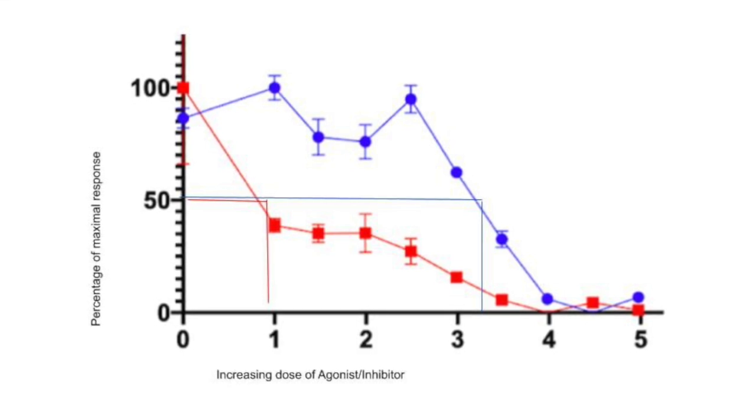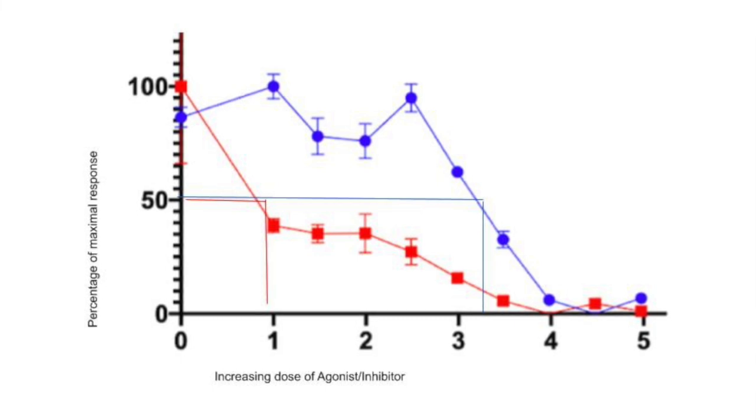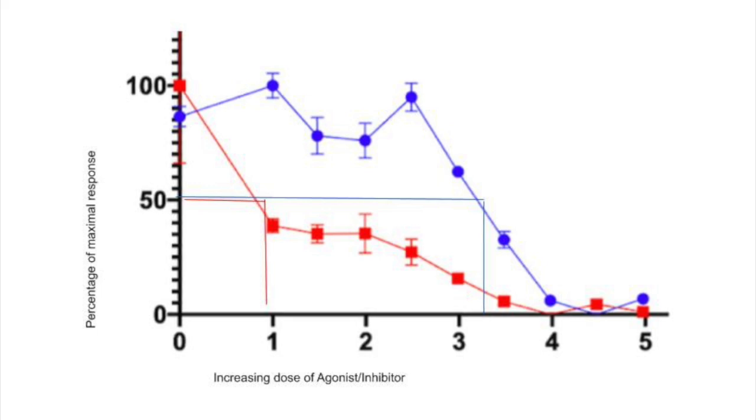The standard curve is then used to determine the concentration of the unknowns. So you use the standard curve to determine the concentration of the analyte in the unknown samples by comparing their response ratios to the standard curve. Let's have a look at some examples.